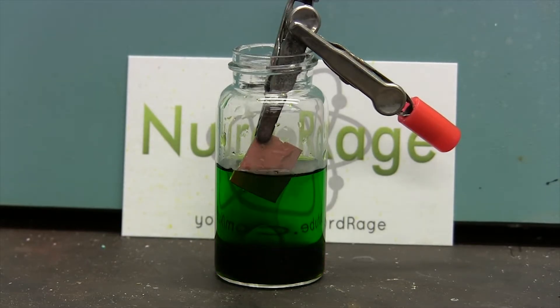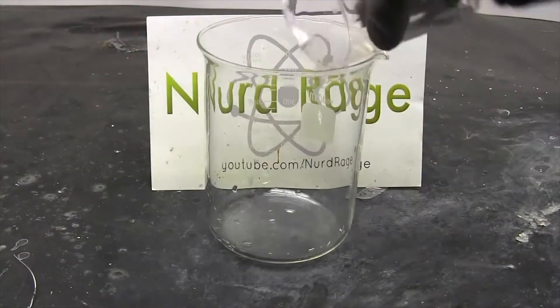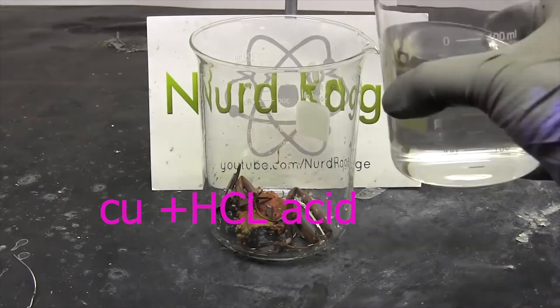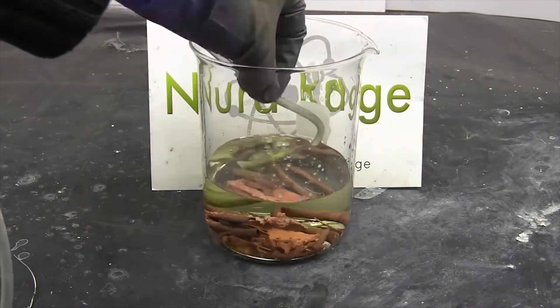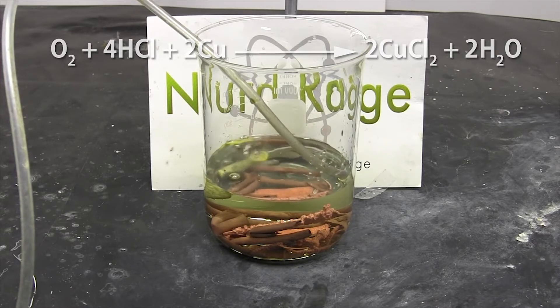The first method: take your copper metals and cover them with hydrochloric acid, just like shown here in the picture. Follow all the steps, and when you finish, you bubble air through it — just like you can see there.